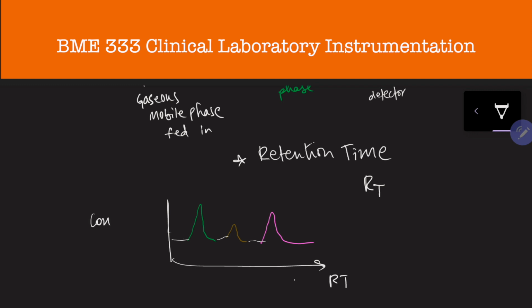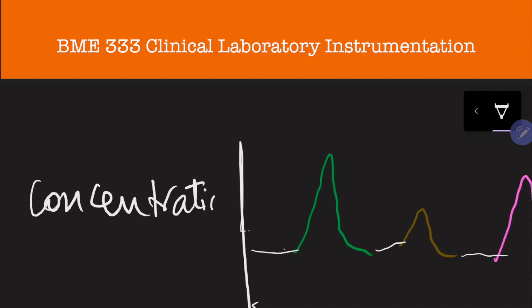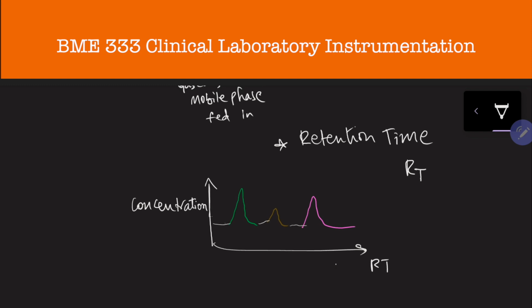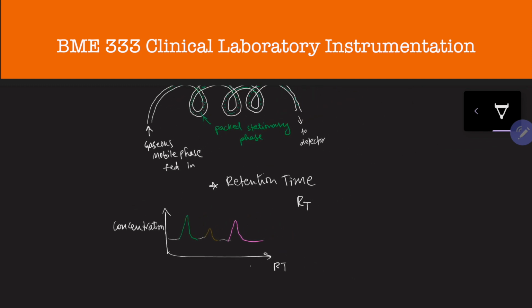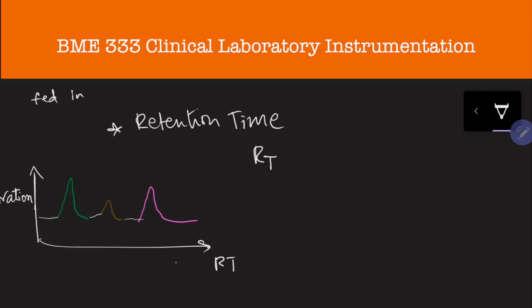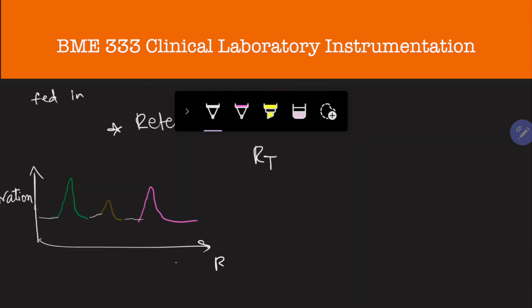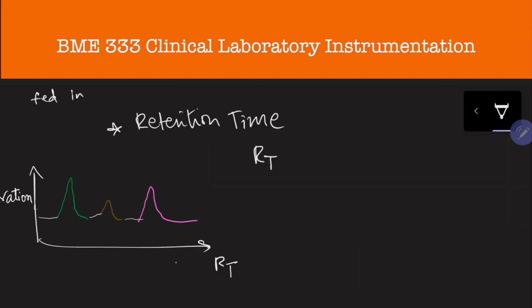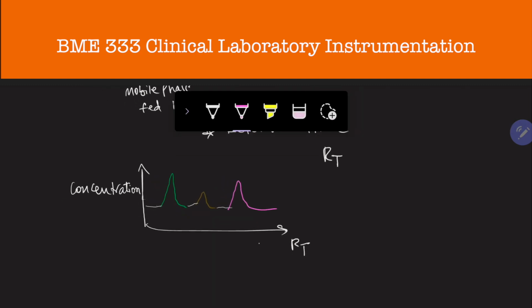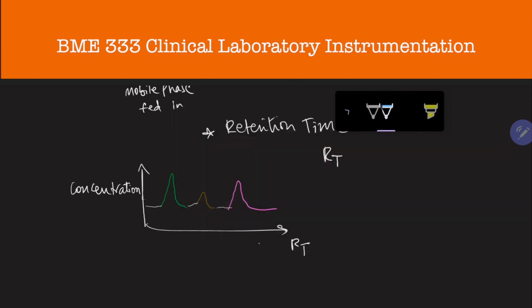And one of the things about GC is that although you get these nice peaks, the resolution is not so nice, which means that similar retention times, or times that are very close together for different components, may tend to overlap, so it could become rather hard to identify exactly which component is present by just looking at the peaks, because some components could have very similar retention times.